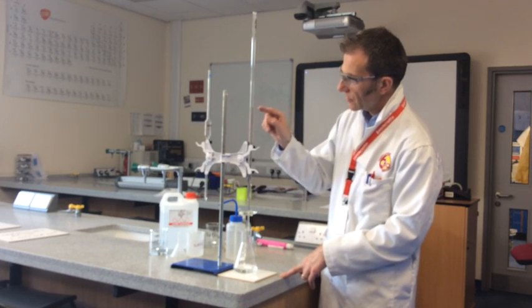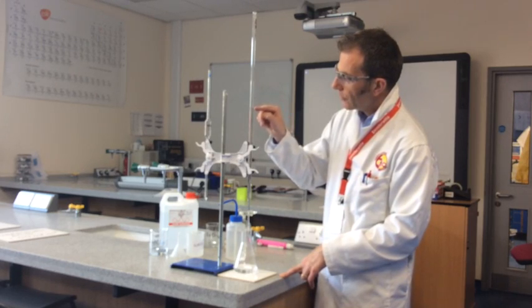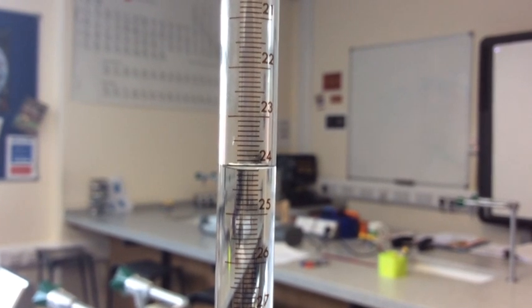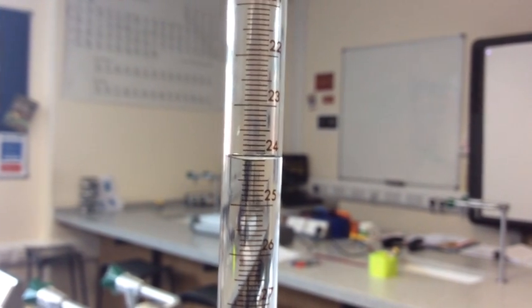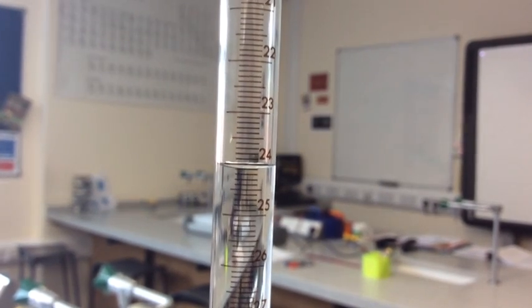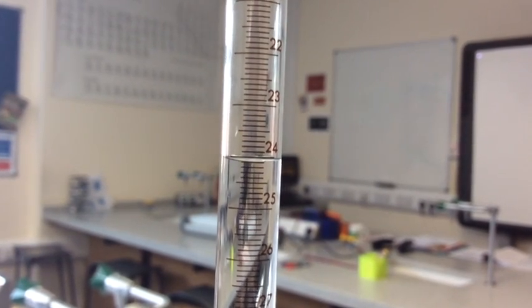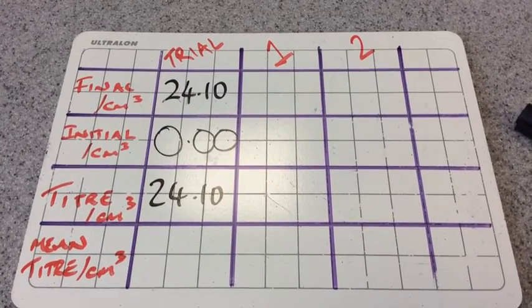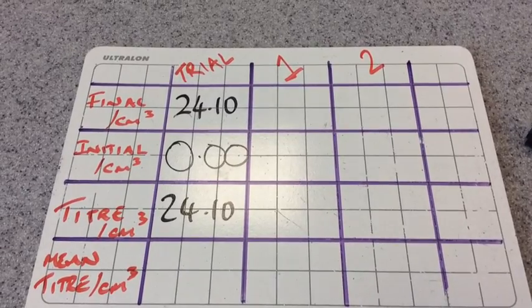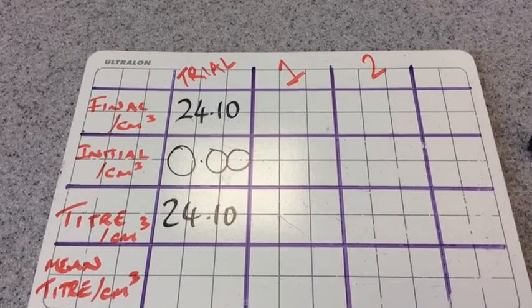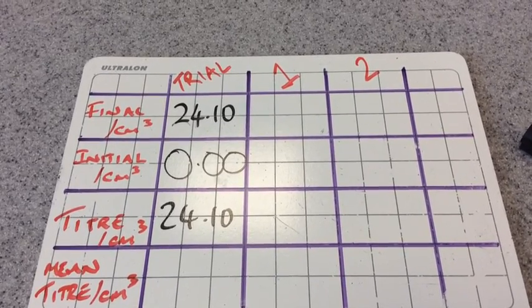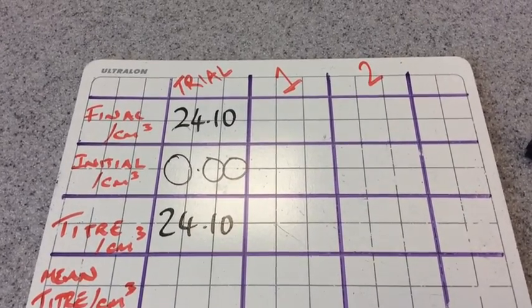So what we need to do first of all is record the burette reading for this trial titration. So I just want to show you that close up. You can see the meniscus is exactly on the first line after the 24. So that's 24.10. So you can see I've got all the results in now for the trial. So the initial reading was 0.00. The final reading is 24.10. And so that means the titra, that's how much we've used from the burette, there's obviously the difference between the two. That's 24.10.